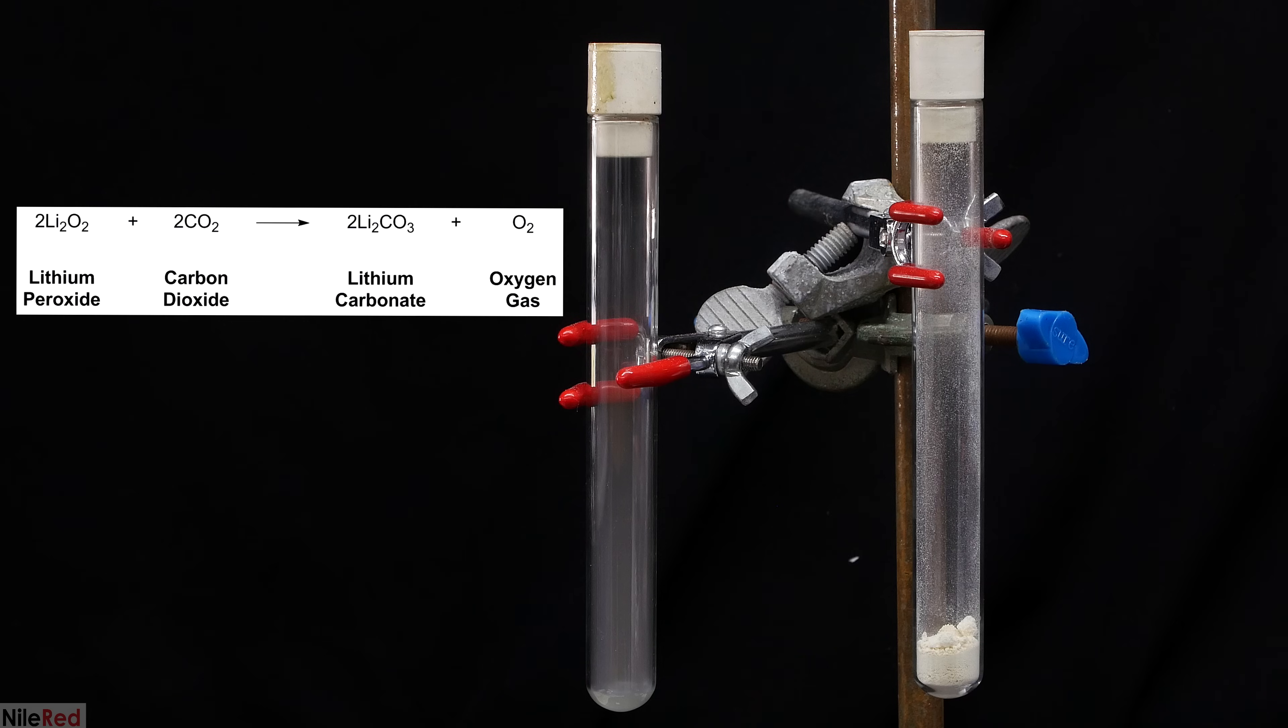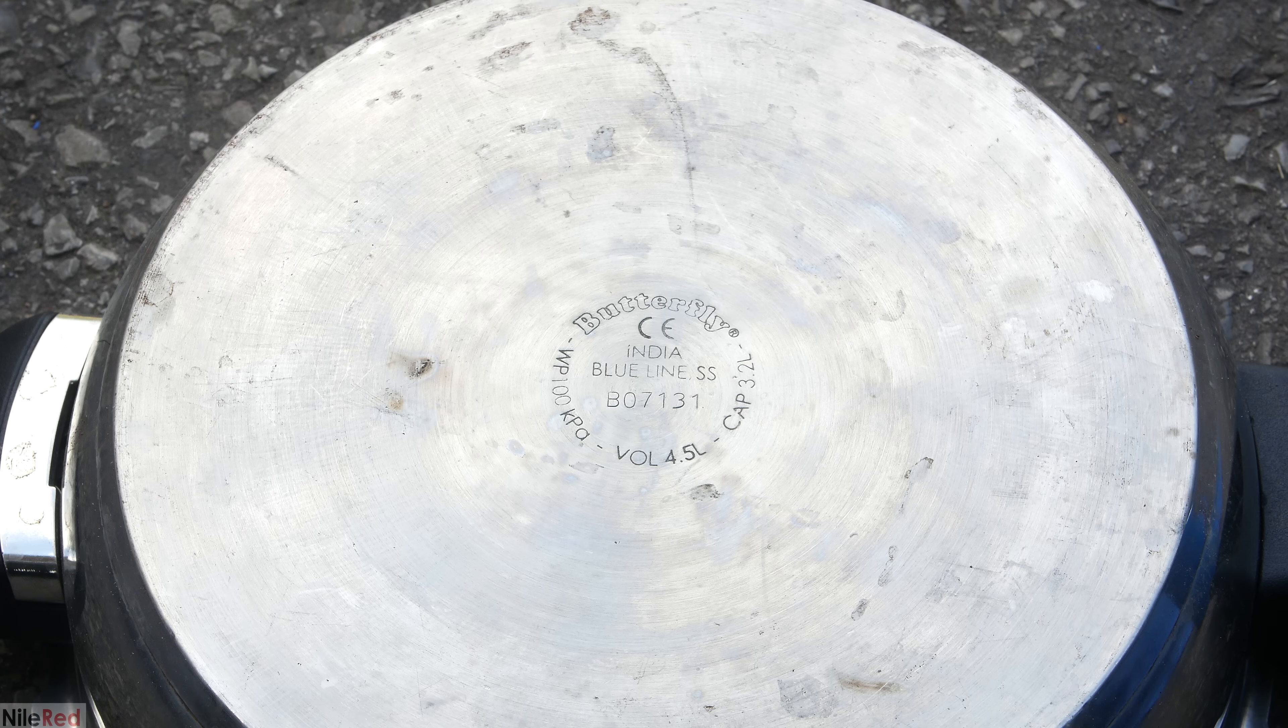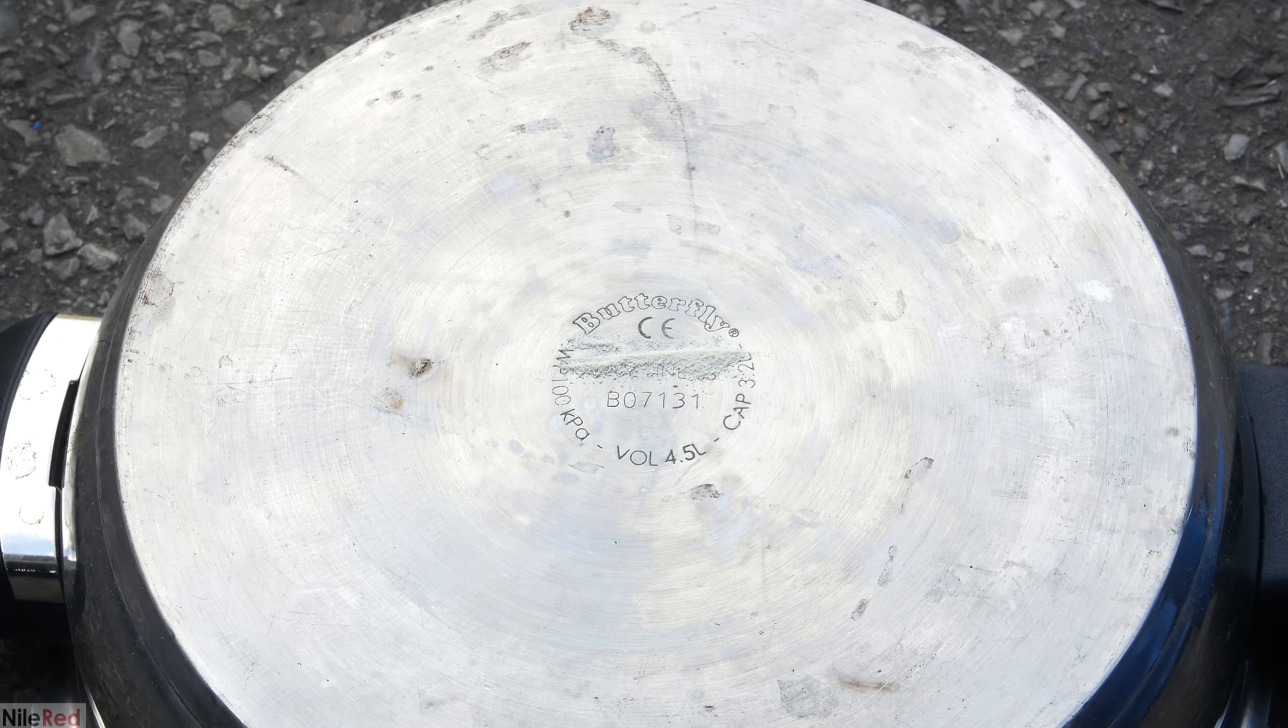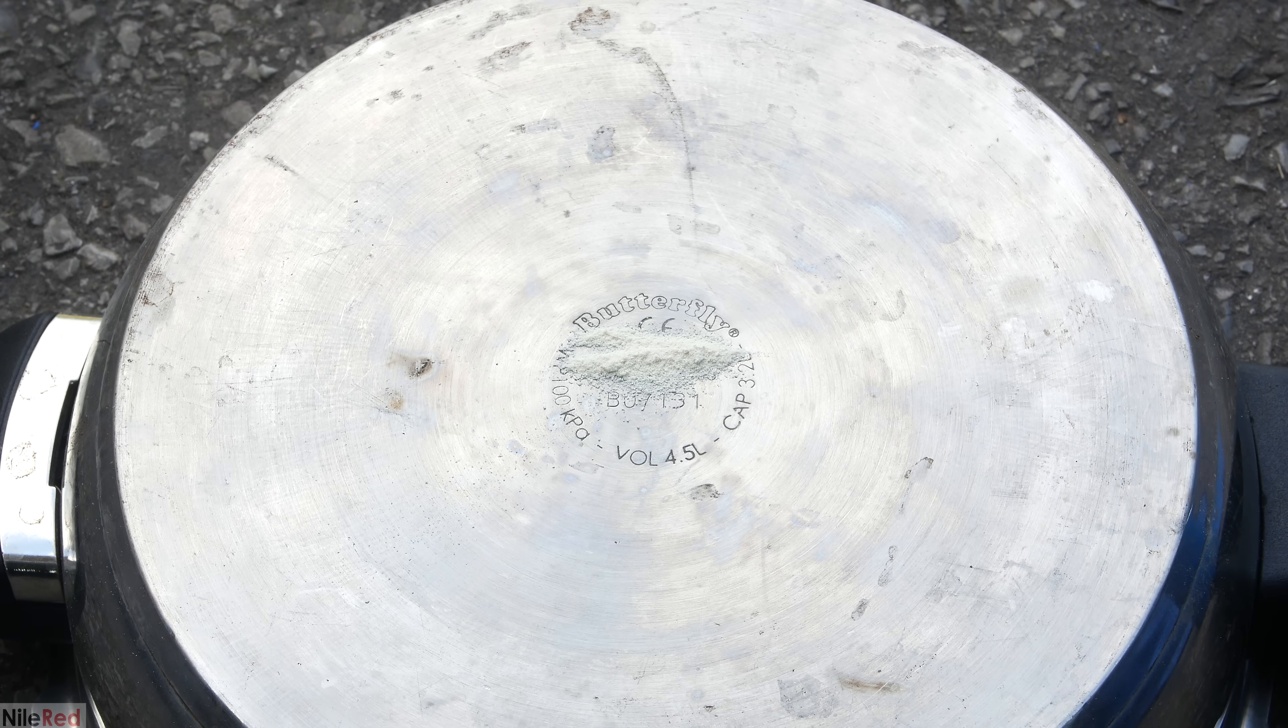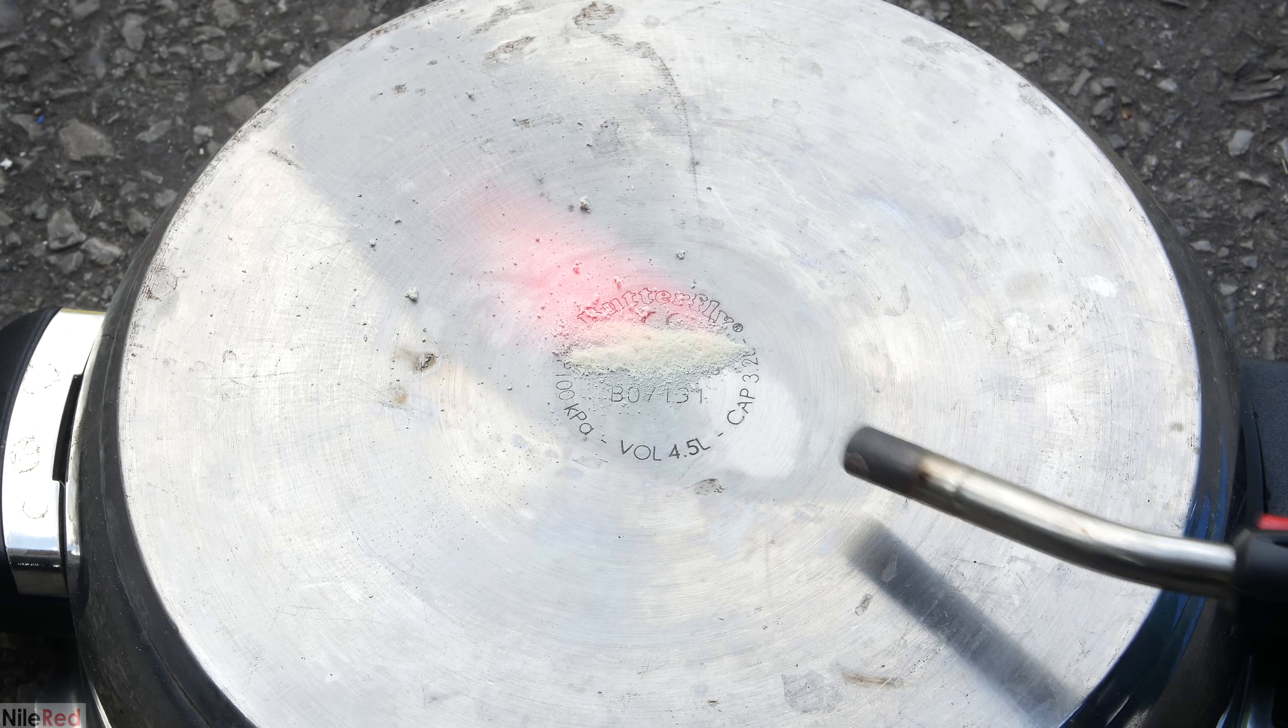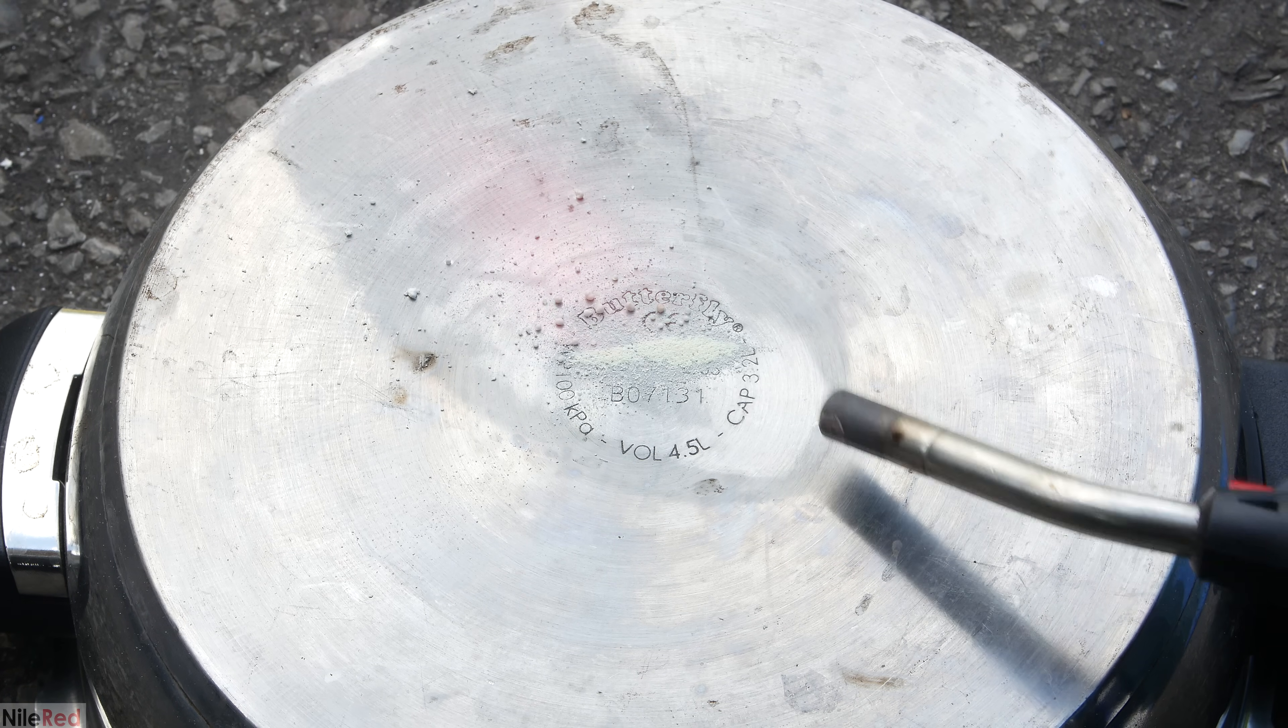Anyway, with that being said, I'm going to move on and do some flame tests. For the flame test, I put a little bit of the lithium peroxide on the bottom of a pan, and then I shot it with a blow torch. The important thing to notice here is the characteristic crimson red color of lithium.